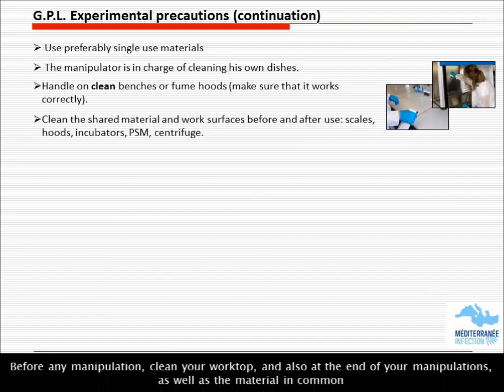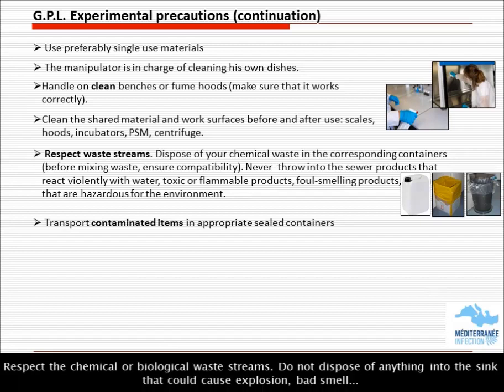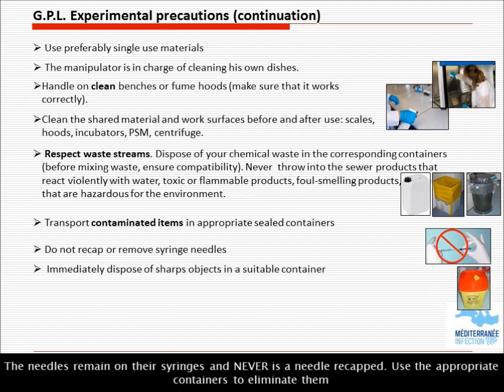Before any manipulation, clean your worktop, and also at the end of your manipulations, as well as the material in common. Respect the chemical or biological waste streams. Do not dispose of anything into the sink that could cause explosion or bad smell. The needles remain on their syringes and a needle is never recapped. Use the appropriate containers to eliminate them.